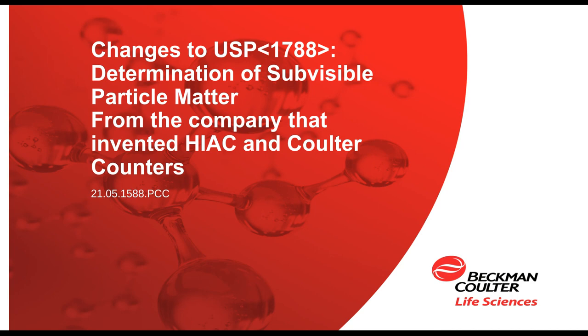Now, the USP revised these chapters in response to the increasing number of biologic drugs in use and the need to differentiate between inherent particles that may be formed as part of the product characteristics and also those potentially harmful particles that may have been introduced to the product from sources such as packaging, processing, filling equipment, and of course personnel. The focus of this chapter is on subvisible particles in the range of 1 to 100 microns in size.